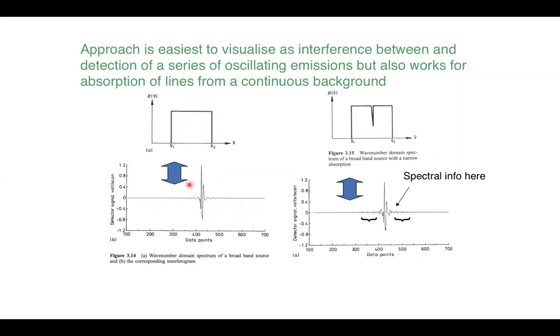So you can see here that there's no absorption. And so what we have here is just simply the detector signal as a function of what is emitted by the light source. But if in this case we put something there which can absorb, we see that there is a depression in the intensity. So you have an absorption peak. So this would be our kind of frequency domain spectrum. But this is then based on the interferogram, which is here.